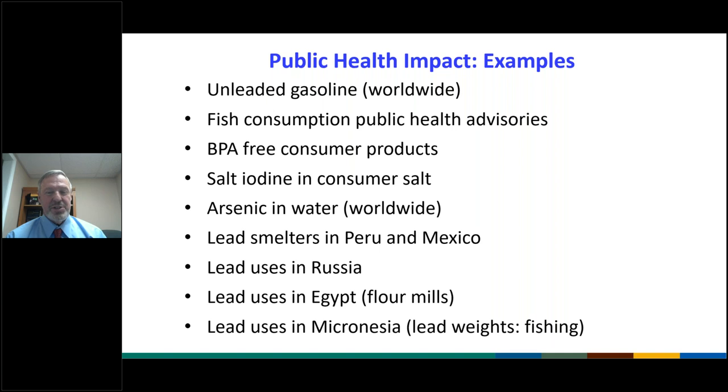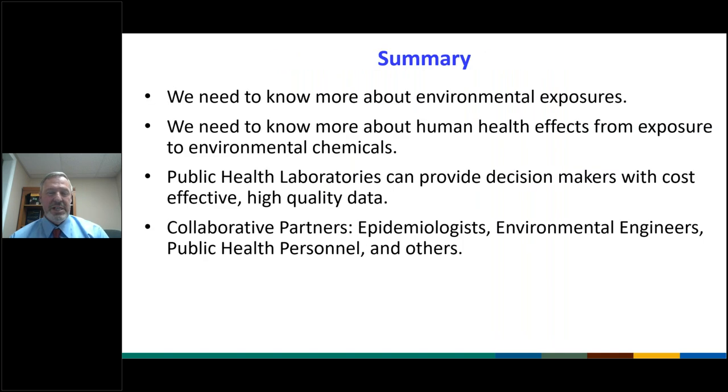Salt iodine in consumer salt is a big deal across the world because of the lack of iodine in populations. Arsenic in water is worldwide. That's very geology dependent. We've worked on biomonitoring studies in Peru and Mexico, and lead uses in Russia. We've done huge biomonitoring studies there. Lead uses in Egypt, it's quite an interesting story. And lead uses in Micronesia that we found just by happenstance, looking at a nutritional study. We were doing lead measurements on the side. That's a whole other talk in itself. All those are individual talks.